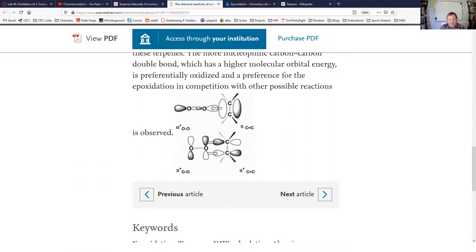Real aromatic molecules typically won't do that, not easily. They tend to have a better shelf life. But that's why it's important to seal your stuff, minimize exposure to oxygen, also minimize exposure to UV light, because UV will also break these down.